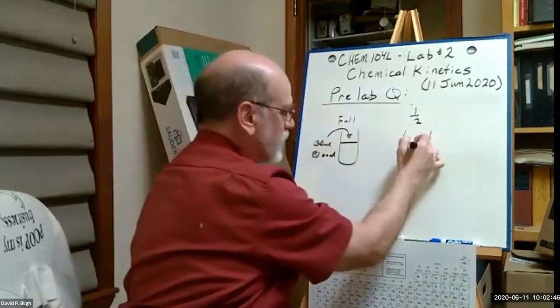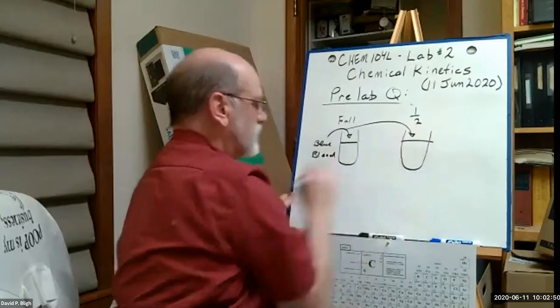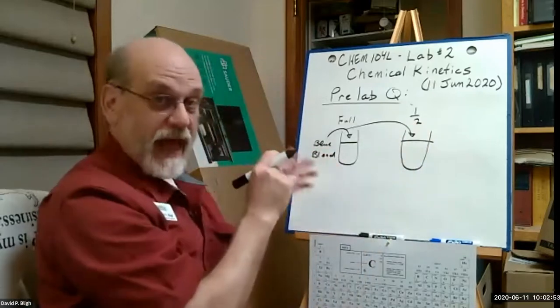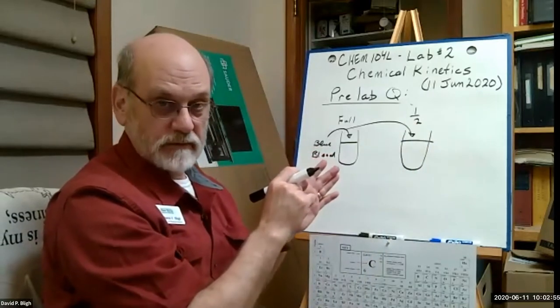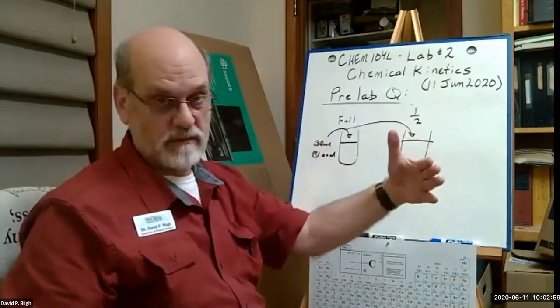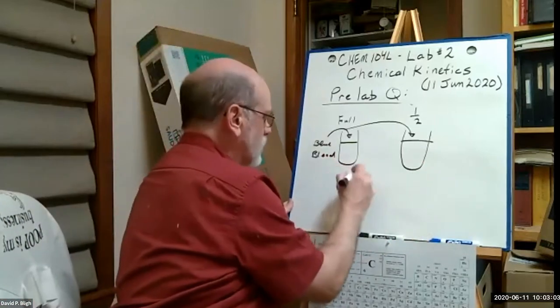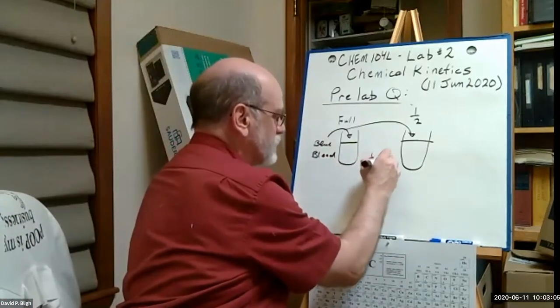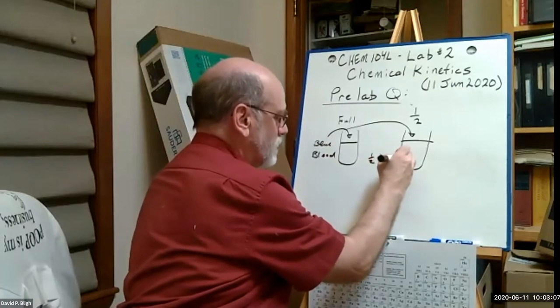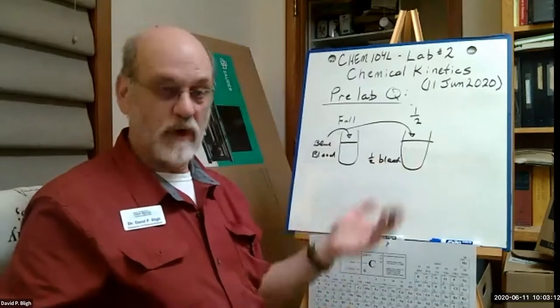And in the half strength, you're going to add the same amount of blue dye, but you're only going to add half as much bleach. Right? So you've got to make up the other half of the volume with something. So if you only use half of the bleach, what are you going to use for the other half? Right? Well, you could use water.